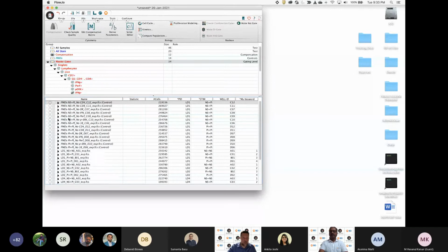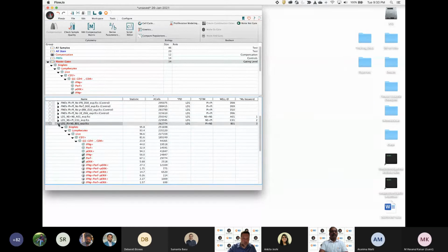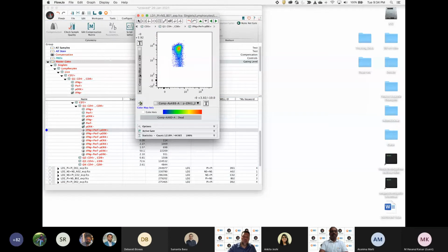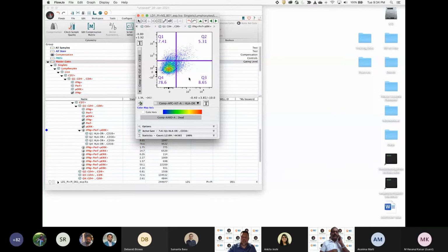And so I'm going to collapse all these samples, go back to my LD1, look at that triple positive, 42 events, 0.12%. Well, what happens when we stimulate for 2 hours? After 2 hours of stimulation, I've got 27% of my events, 12,000 downstream, and I can always open that up, go downstream, look at different markers. Maybe I want to do CD38 versus HLA-DR and get an activation state for that, right? I can always add additional gates downstream.